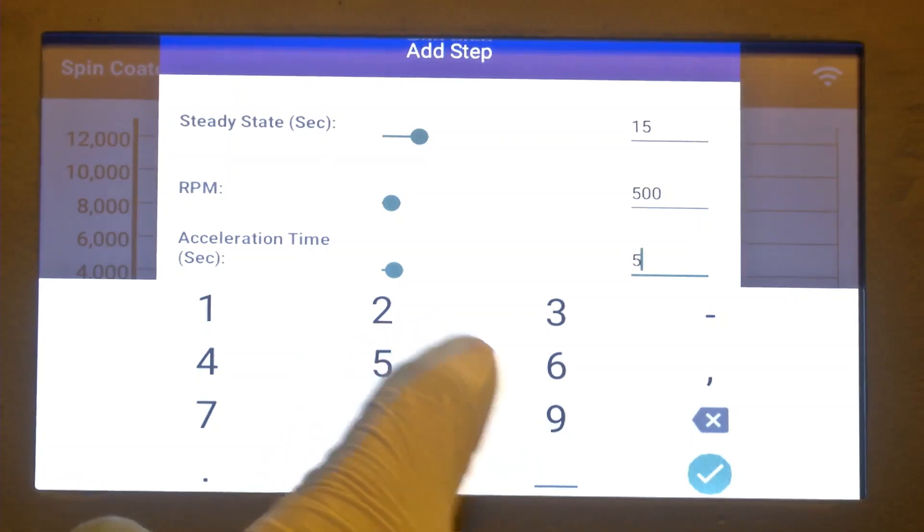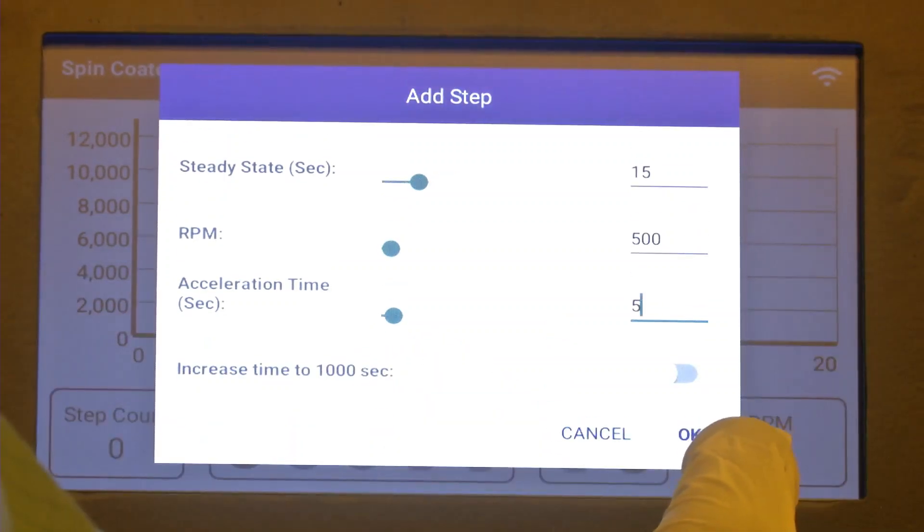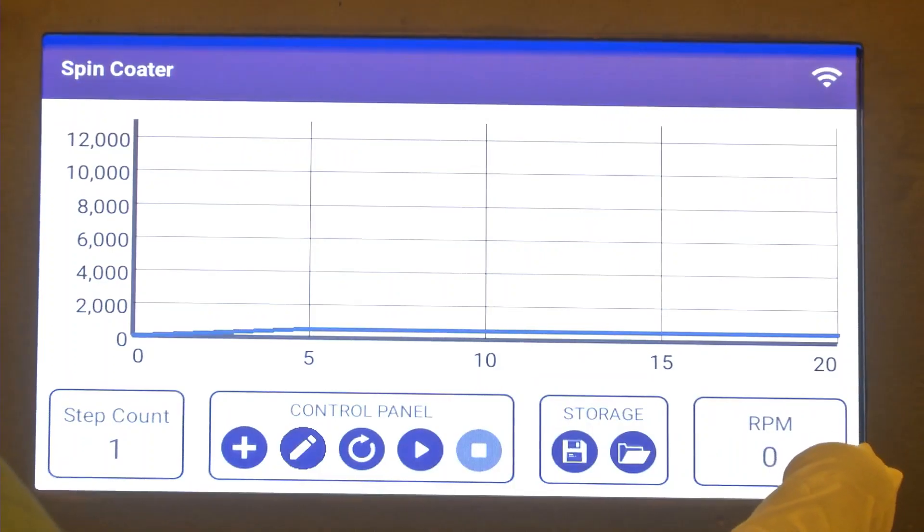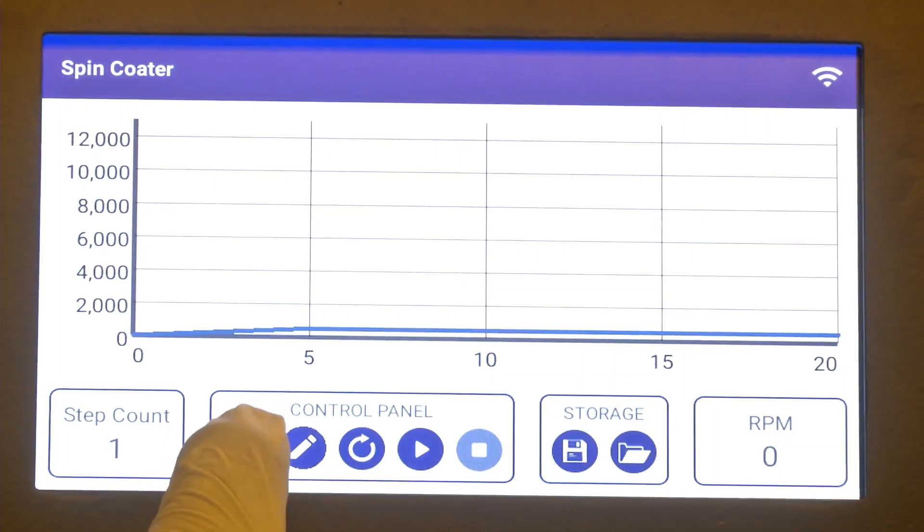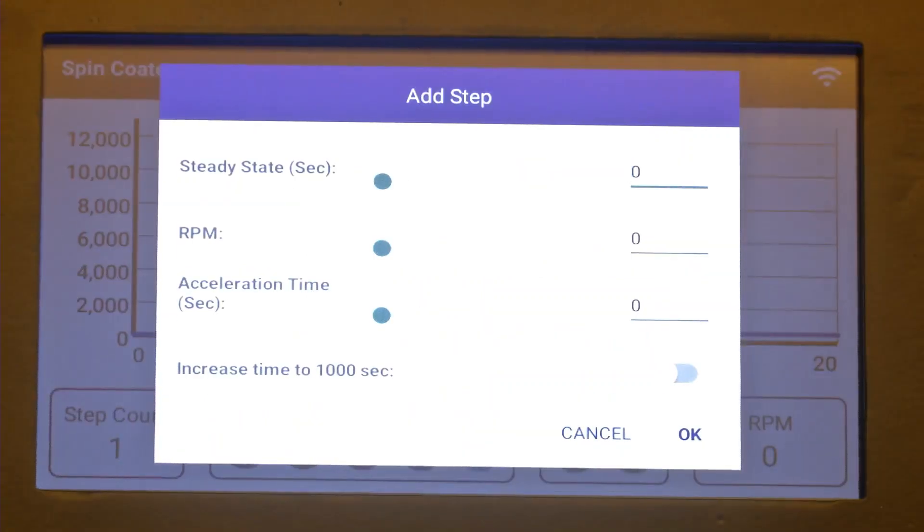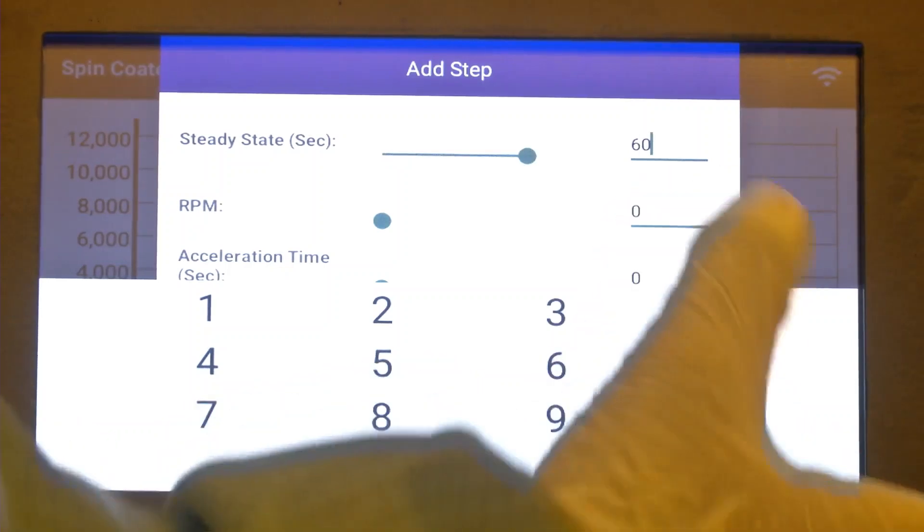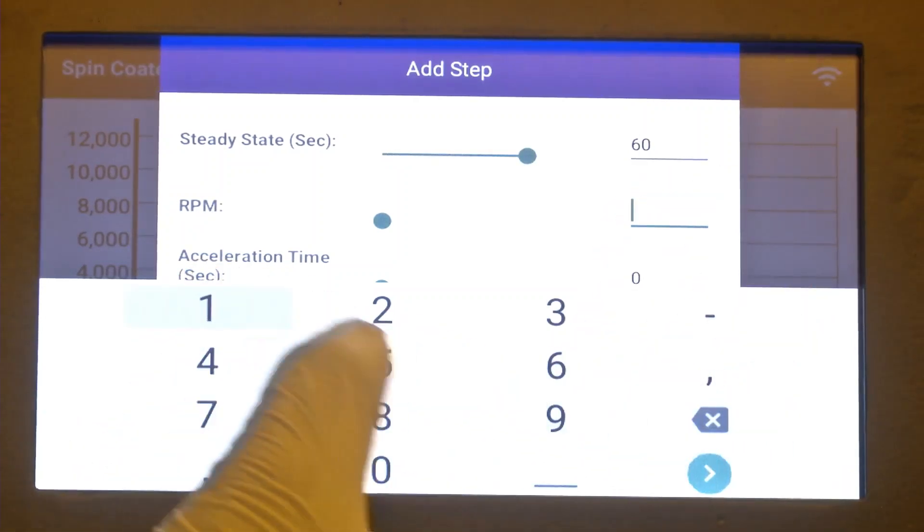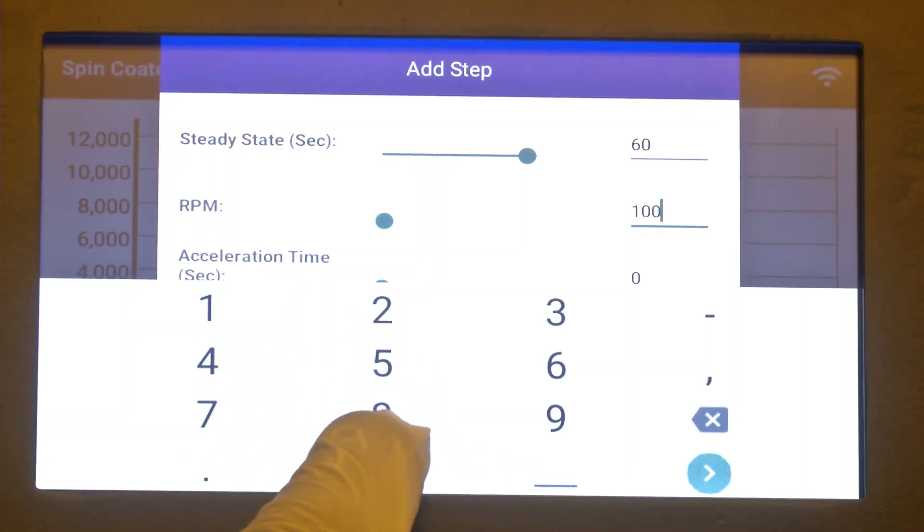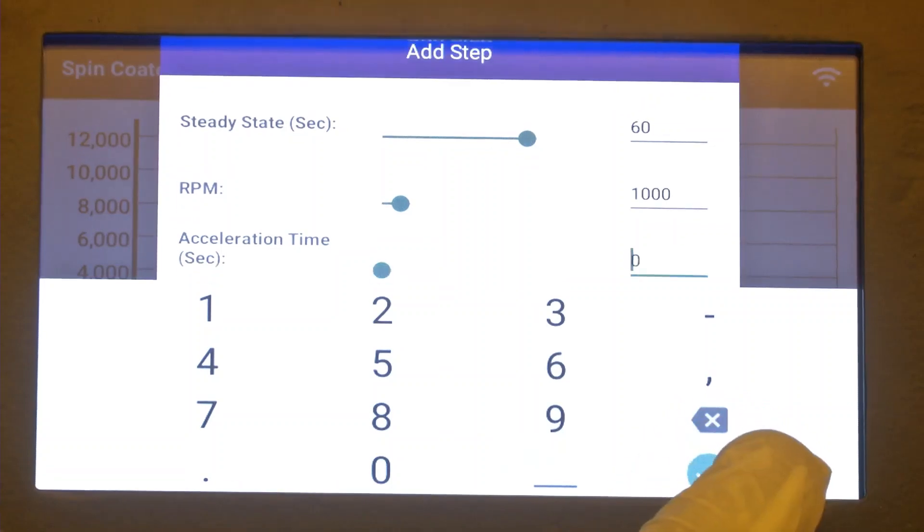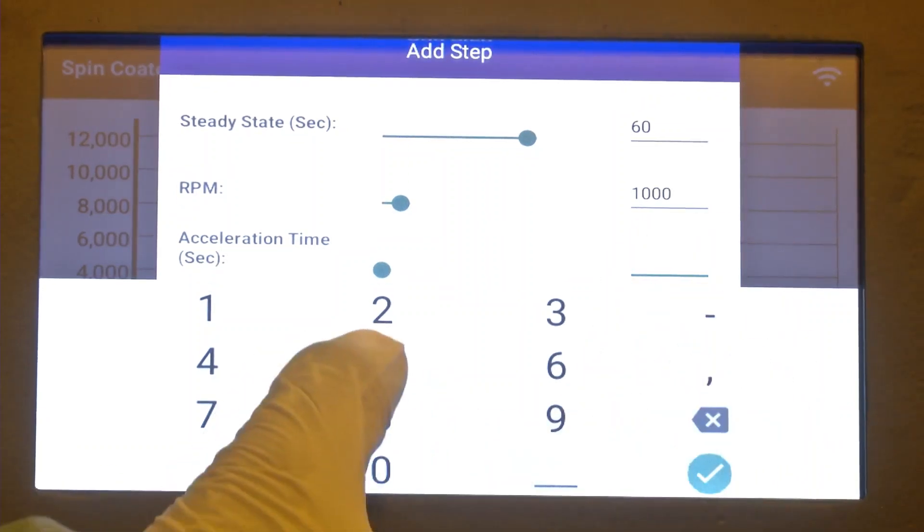We can give the acceleration as well. The next step is to give the higher speed to ensure that the solvent which is spread uniformly can now be evaporated and thinned down. Generally for photoresist we give 4000 RPM for 40 seconds, but in this case we have optimized to get a flexible substrate so we are giving it for 60 seconds at 1000 RPM. The acceleration will remain almost the same, around 400.